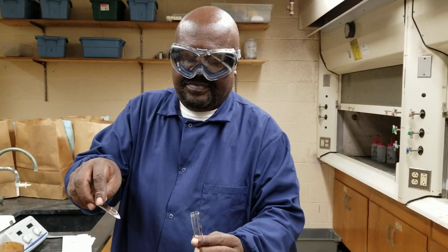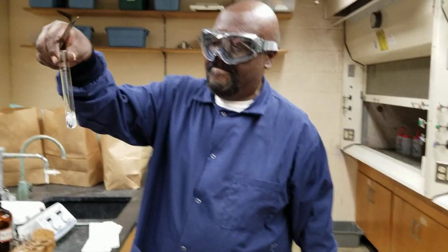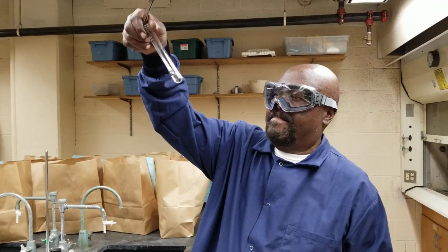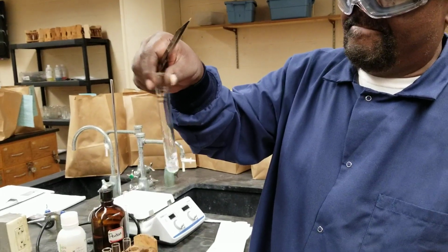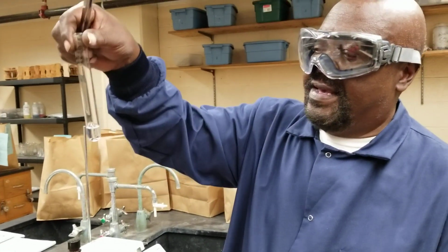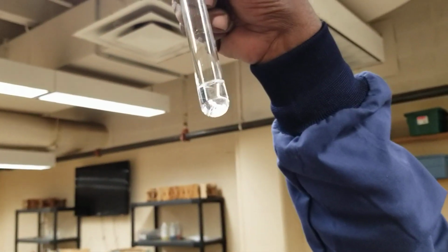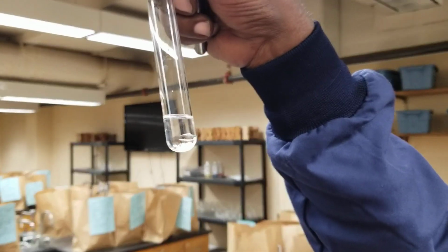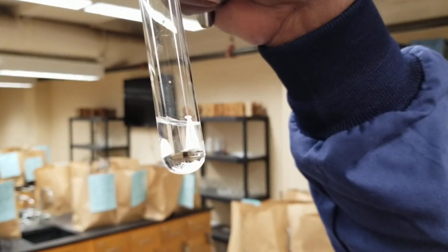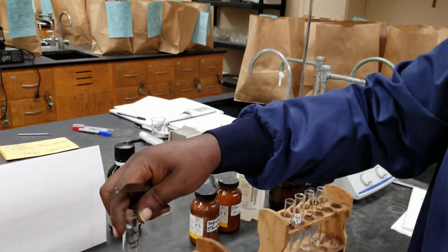All right, let's add it in. It might look clear here, but if you look in the bottom, it's all sitting down there as white stuff. So that's our result in the case of sodium chloride and cyclohexane.